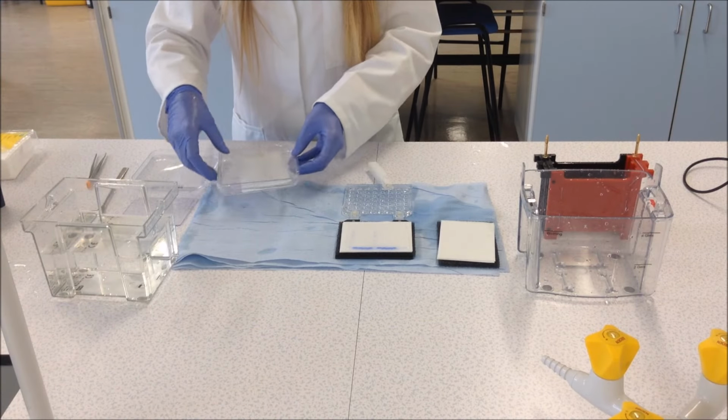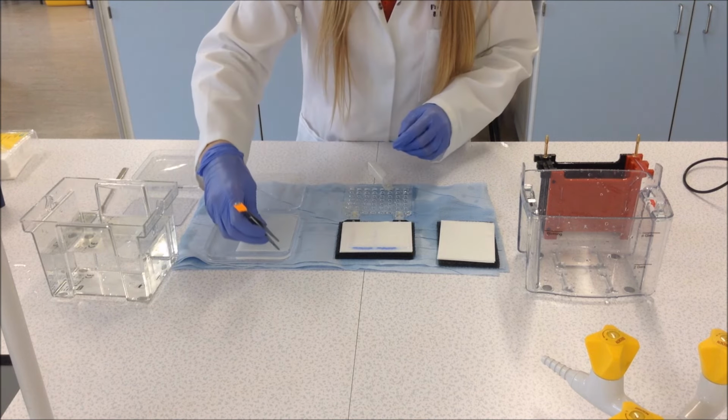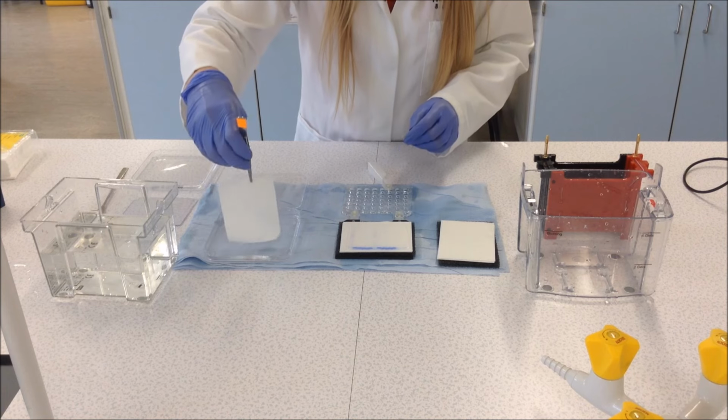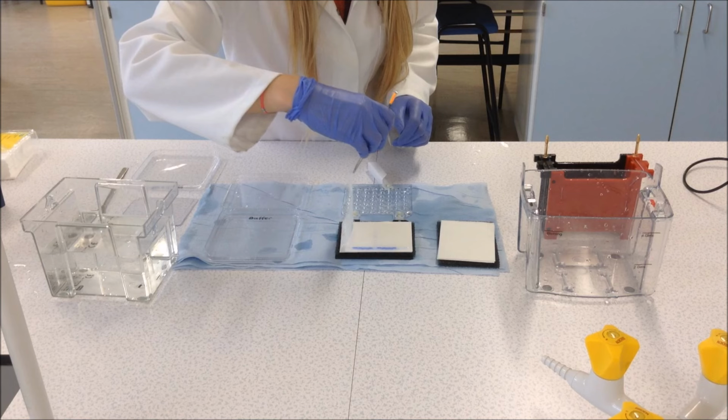If you remember from the preparatory steps, we had the nitrocellulose membrane soaking in some transfer buffer. What we are then going to do is remove the nitrocellulose membrane from the transfer buffer, and place it onto the polyacrylamide gel.